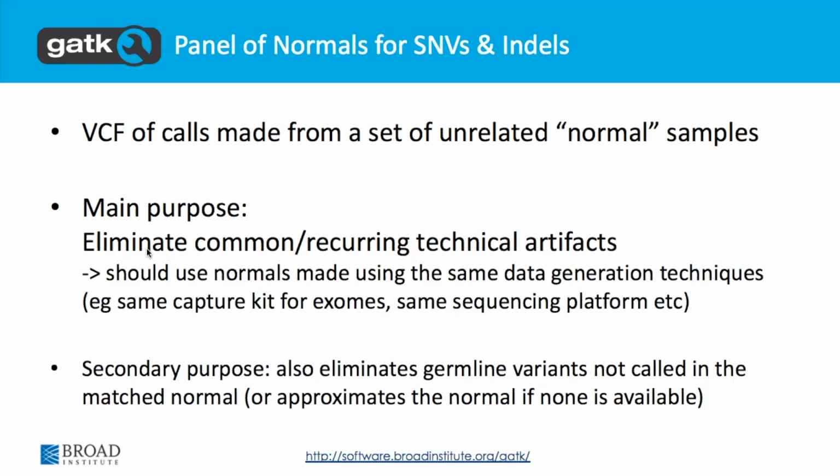Would it matter? So are you looking at doing somatic analysis on those organisms? Yes. Let's say I have an evolved population, a very similar case to a cancer case, but it's just microbial. Oh, okay, I see. So then making the panel of normals, could I include samples of strains for which the ploidy could vary from diploid to triploid to?